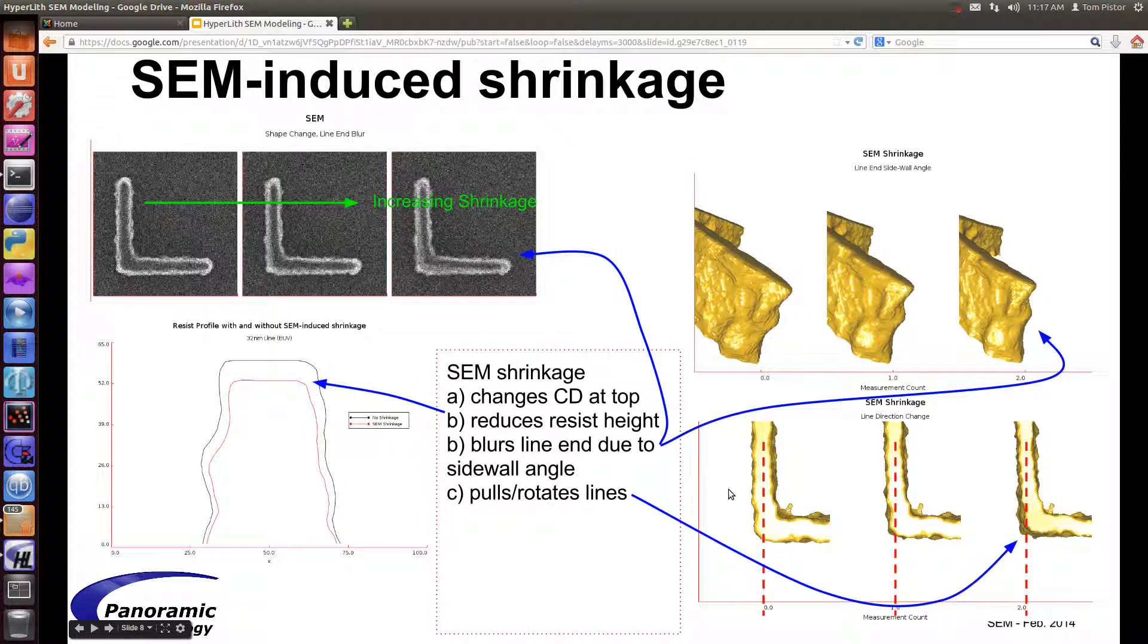SEM also induces shrinkage. In this case, these are simulated SEM images as the shrinkage is increased. Here we have no shrinkage, and here I think we have 10% and 20% shrinkage—it might be 5% and 10%, I'm not sure. But as you can see, this line angle is changing.